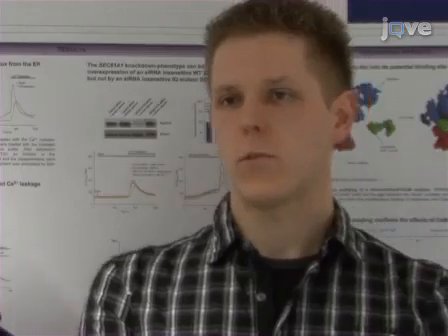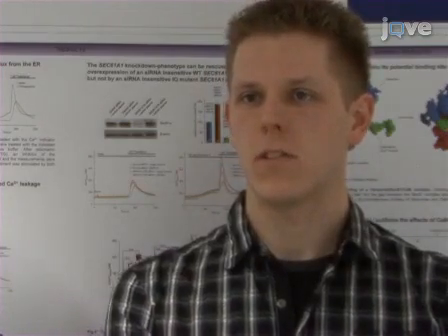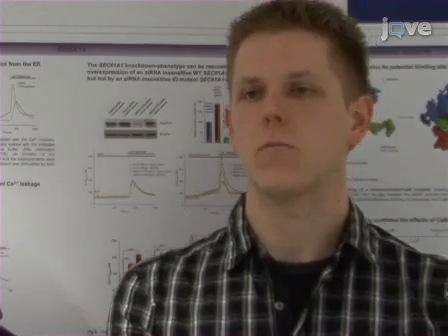After watching this video, you should have a good understanding of how to combine siRNA-mediated gene silencing in human cells with live cell calcium imaging. Following this procedure, other methods like the expression of cDNAs with disease-linked mutations can be performed in order to answer additional questions, like the potential impact of disease-linked mutations in relevant components.